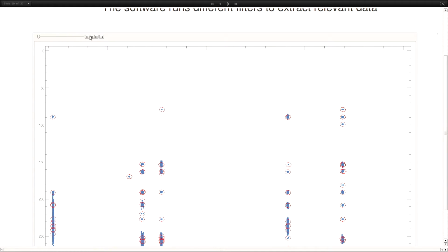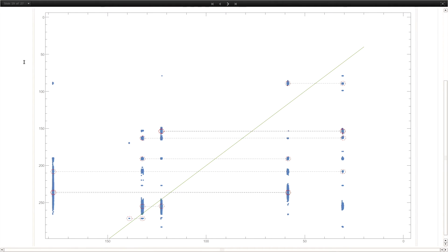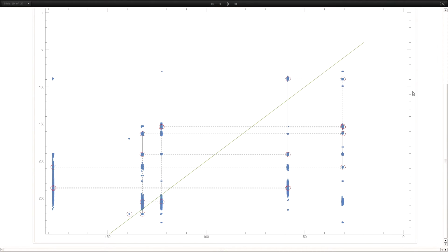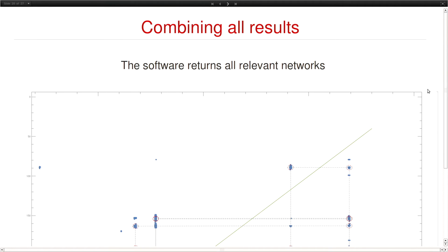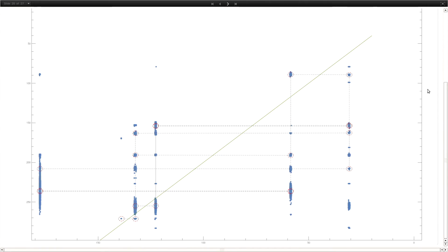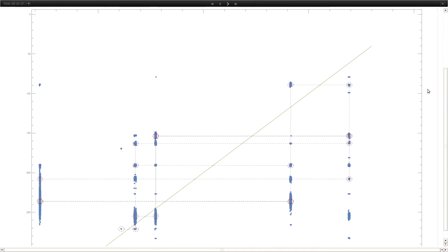And when I have all this data, I just run some filters to remove the noise and get the data I want, like here. There are some theoretical aspects of all this that have to occur, so at least I know a little bit what I'm looking for. So anyway, after running all the filters and having all this cool data here, I'm finding a network. Remember, these networks are representing these connected carbons in the molecule, but it's not a perfect one here.